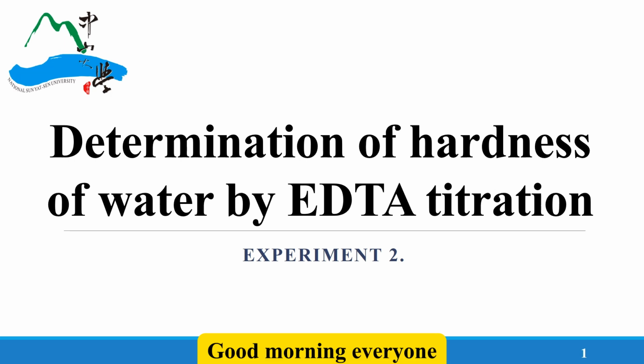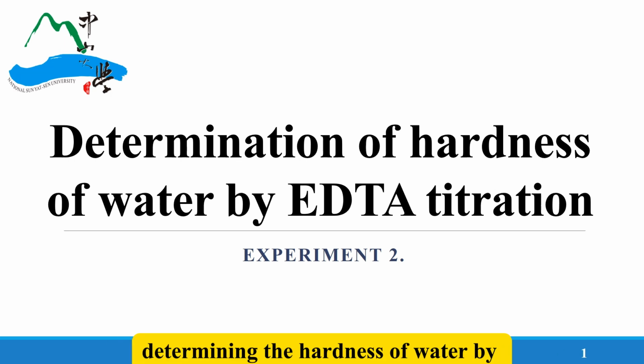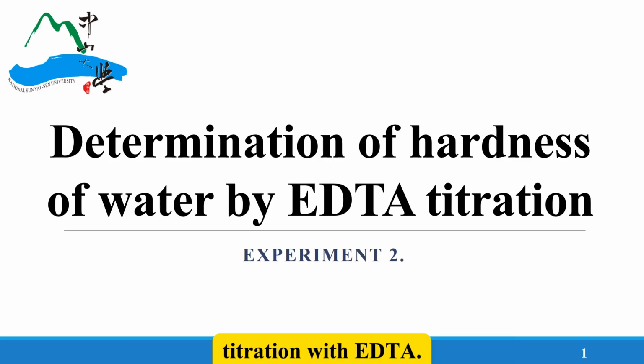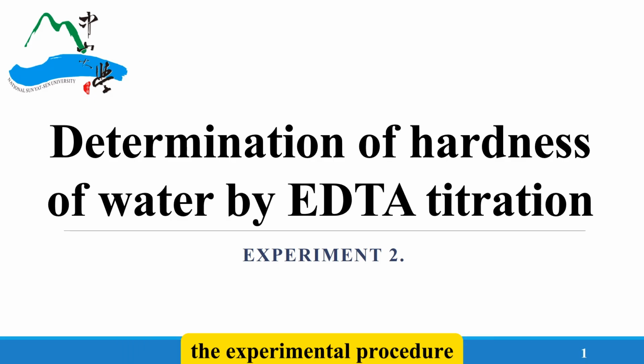Good morning, everyone. Today we're going to discuss Experiment 2, Determining the Hardness of Water by Titration with EDTA. We will cover the fundamental principles, the experimental procedure, and the data analysis required.